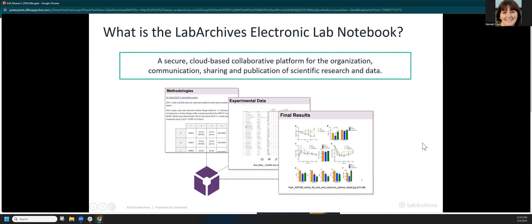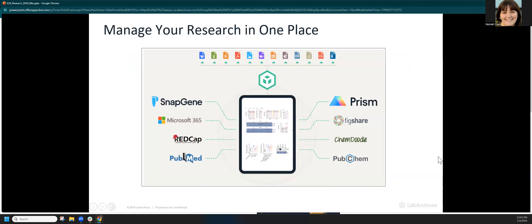Lab Archives is a secure, cloud-based system designed to help you with communication — and for me, that's really the main point of using an electronic lab notebook. Often labs are still using paper lab notebooks, handwritten notes, printing things, cutting and pasting, and there's always going to be some loss of information in that process. Having file storage, attachments, cell and office documents, notes, observations, processes, steps, and calibrations all in one place helps you stay organized and lets colleagues and supervisors check in.